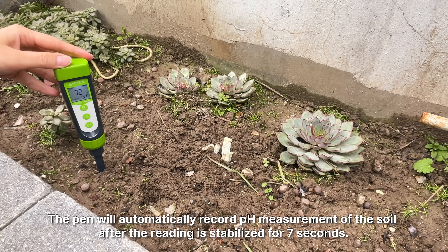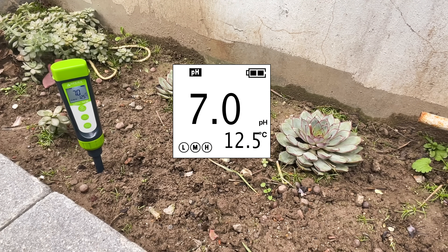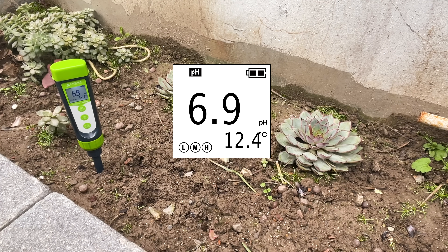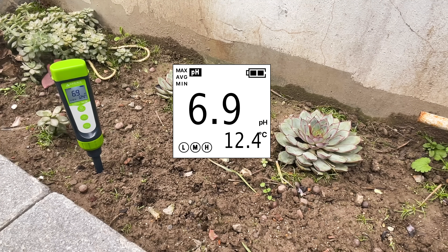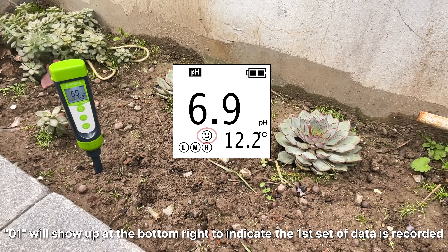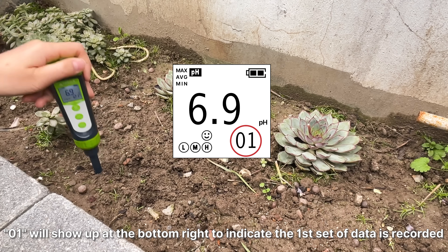The pen will automatically record the pH measurement of the soil after the reading is stabilized for seven seconds. Zero-one will show up at the bottom right to indicate the first set of data is recorded.